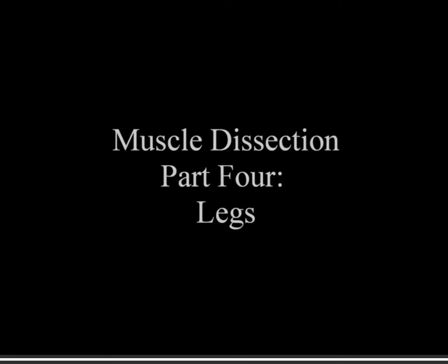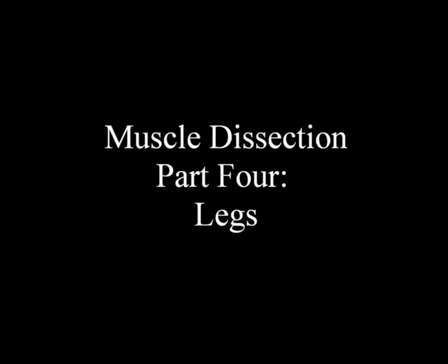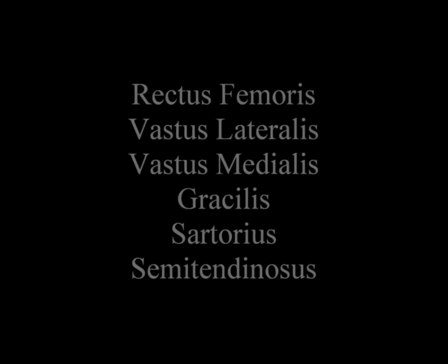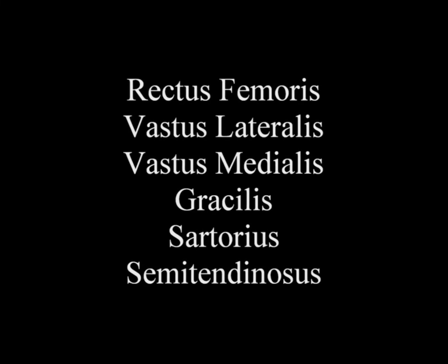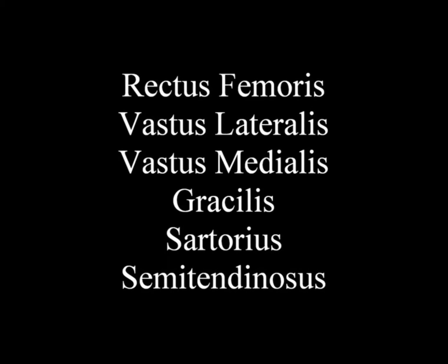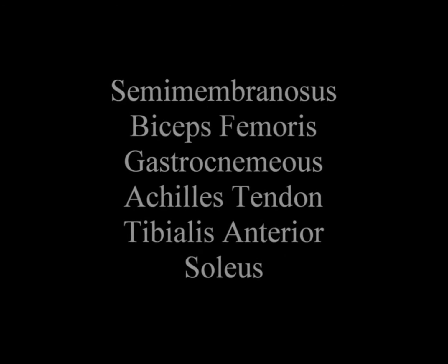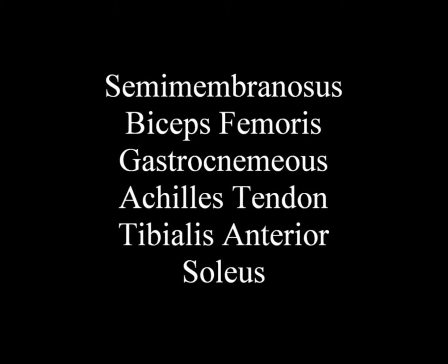Muscle dissection part 4, legs. This video will show you how to find the rectus femoris, vastus lateralis, vastus medialis, gracilis, sartorius, semitendinosus, semimembranosus, biceps femoris, gastrocnemius, Achilles tendon, tibialis anterior, and the soleus.